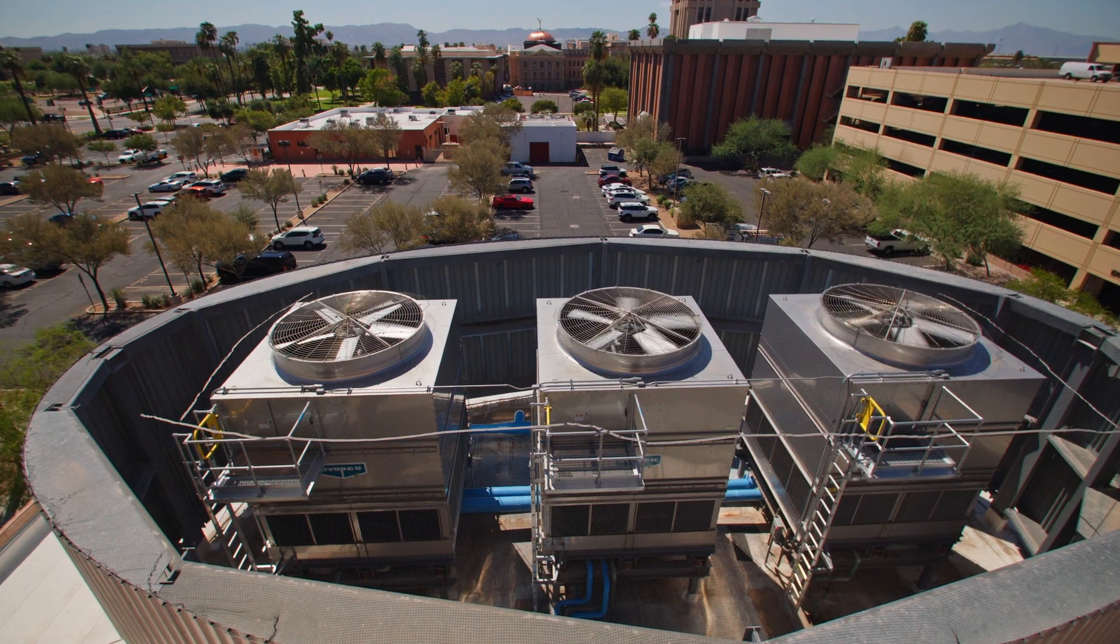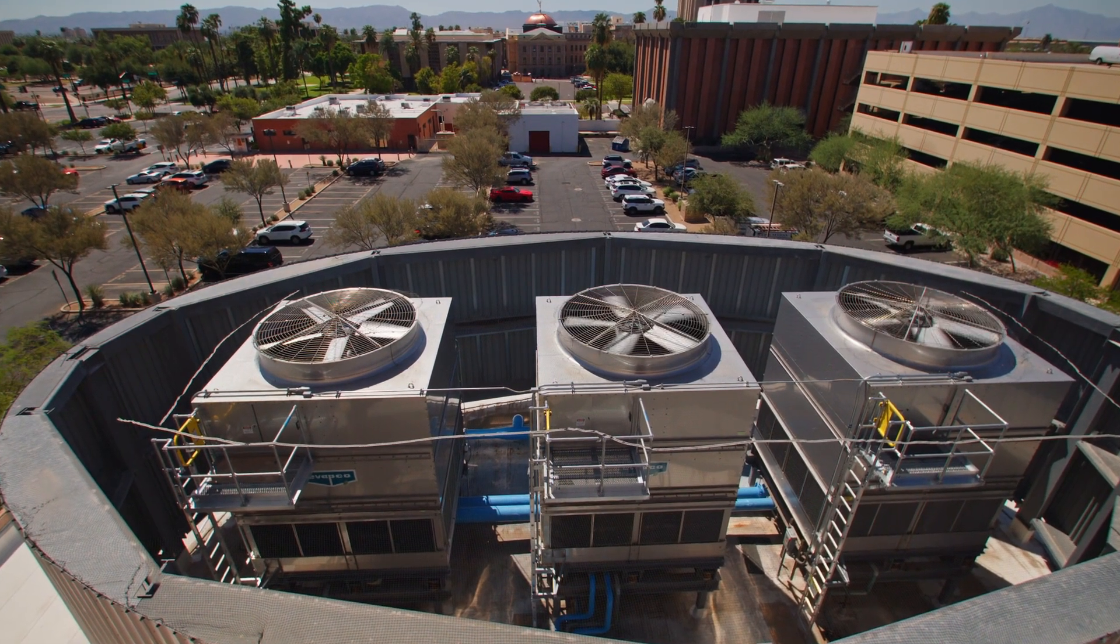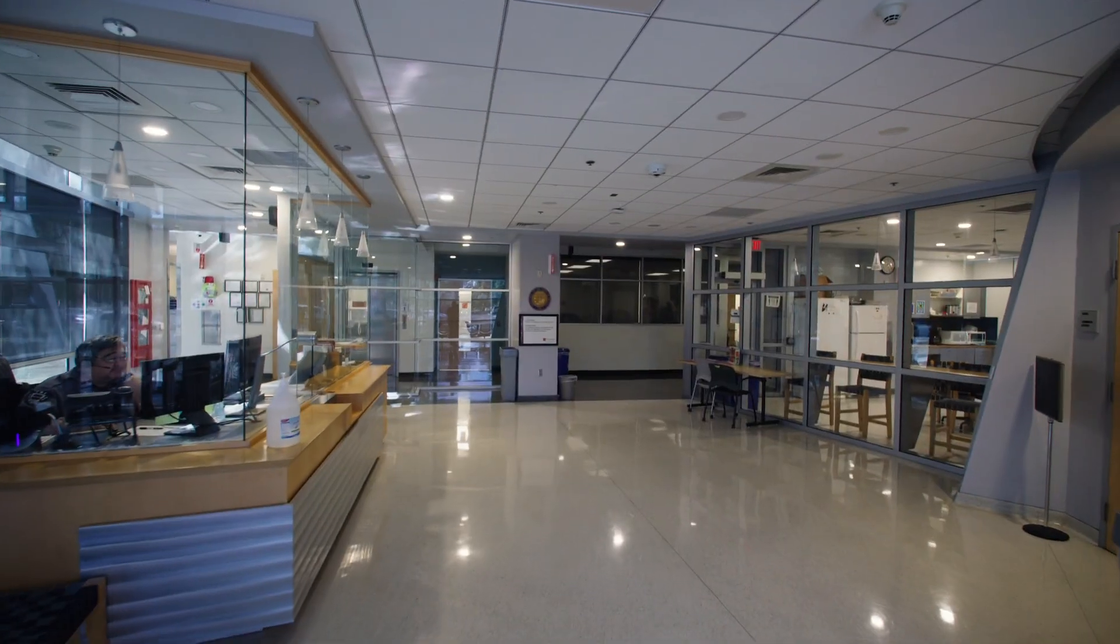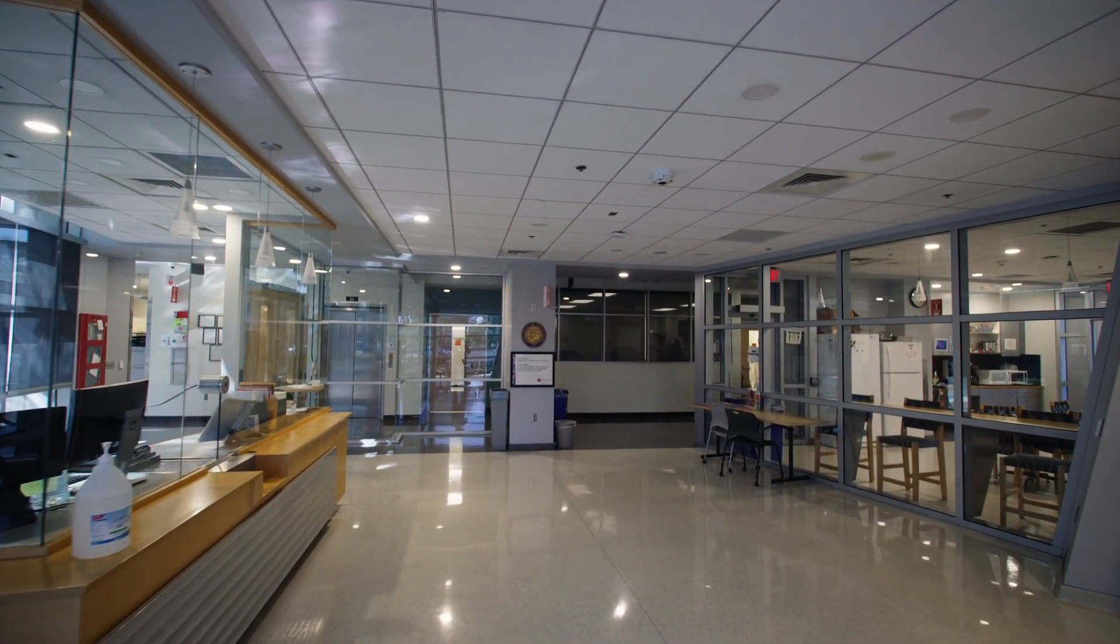Even outside high containment zones, a single-pass HVAC system replaces every molecule of air in the entire facility once every 12 minutes.